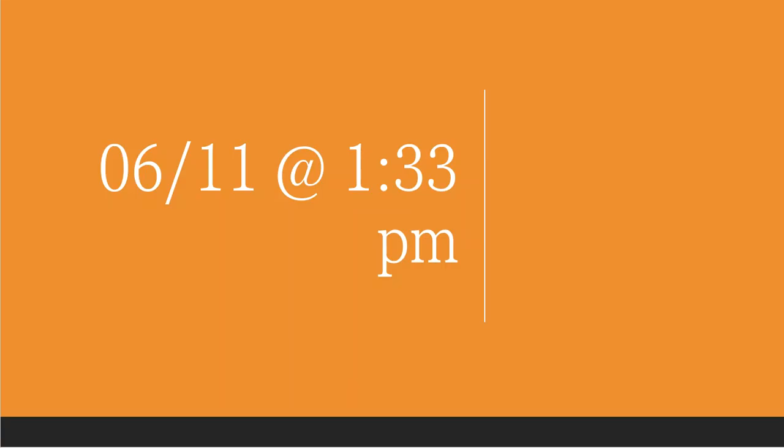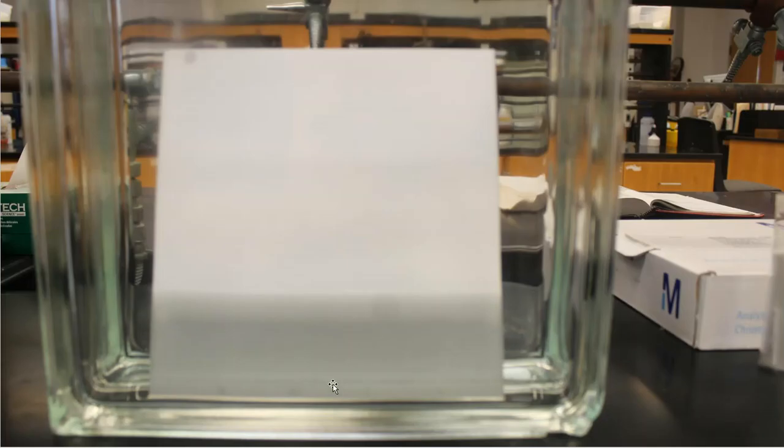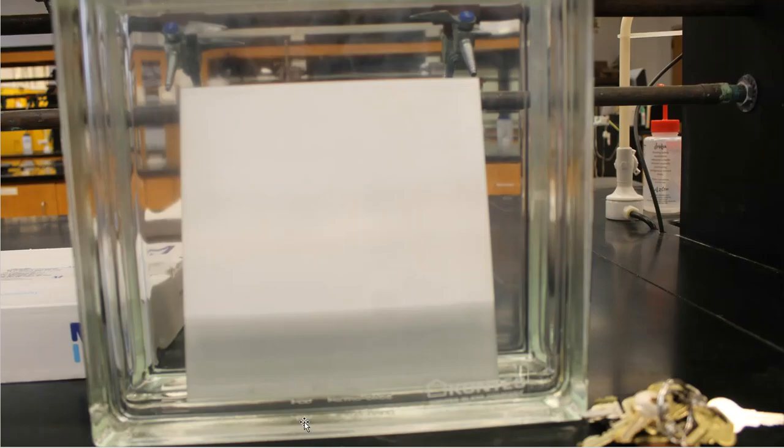Okay. So now at 1:33, a couple of minutes later, like 3 minutes later, I go back and take more pictures for you of each of the TLC tanks. And this is what I see. Notice how fast it moved up. Right? So here is the first tank, this is ethyl acetate. Here's the second tank that has my hexane in it. And here is my third tank that has the 50-50 mix in it.